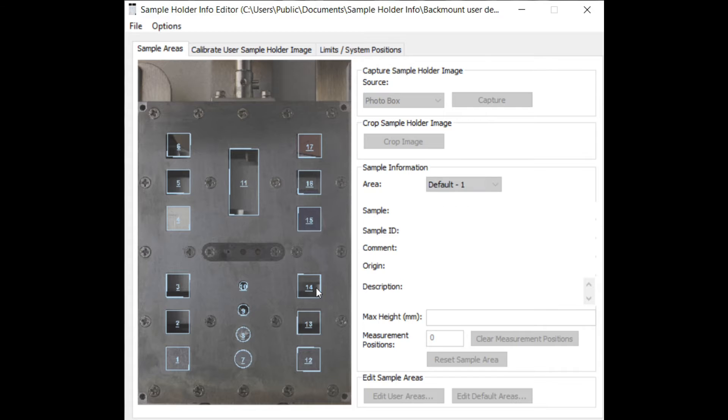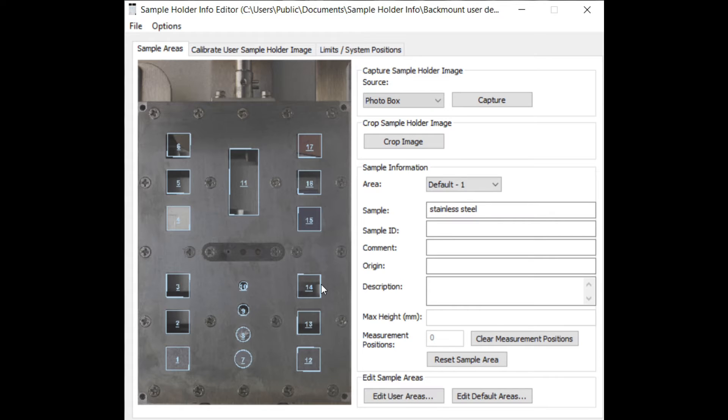On your instrument you will find one SHI file for each sample holder you have. It is highly recommended to keep this file always up to date, especially on a multi-user instrument.